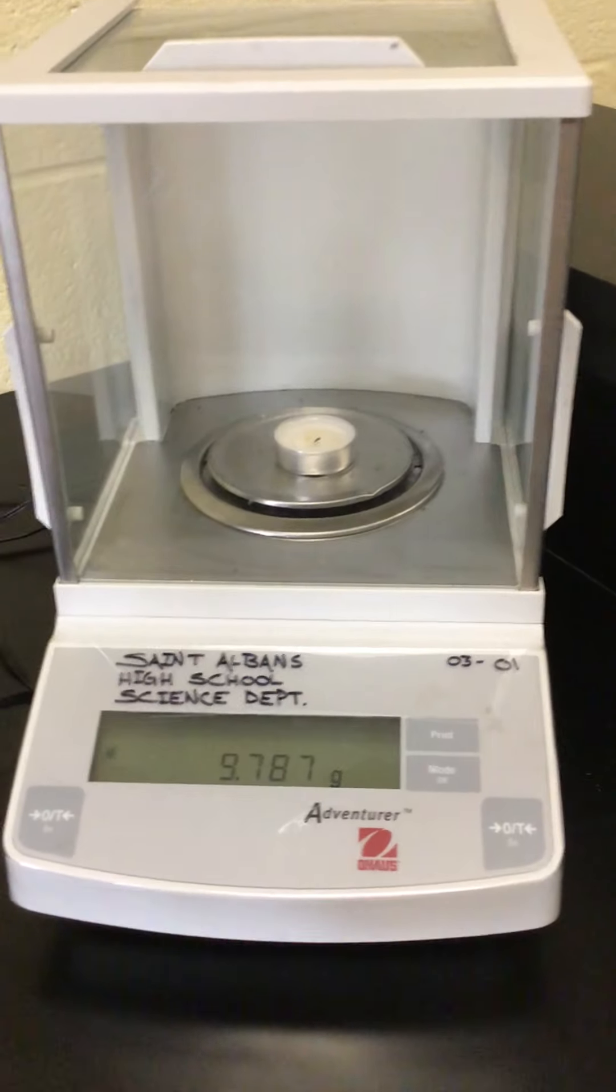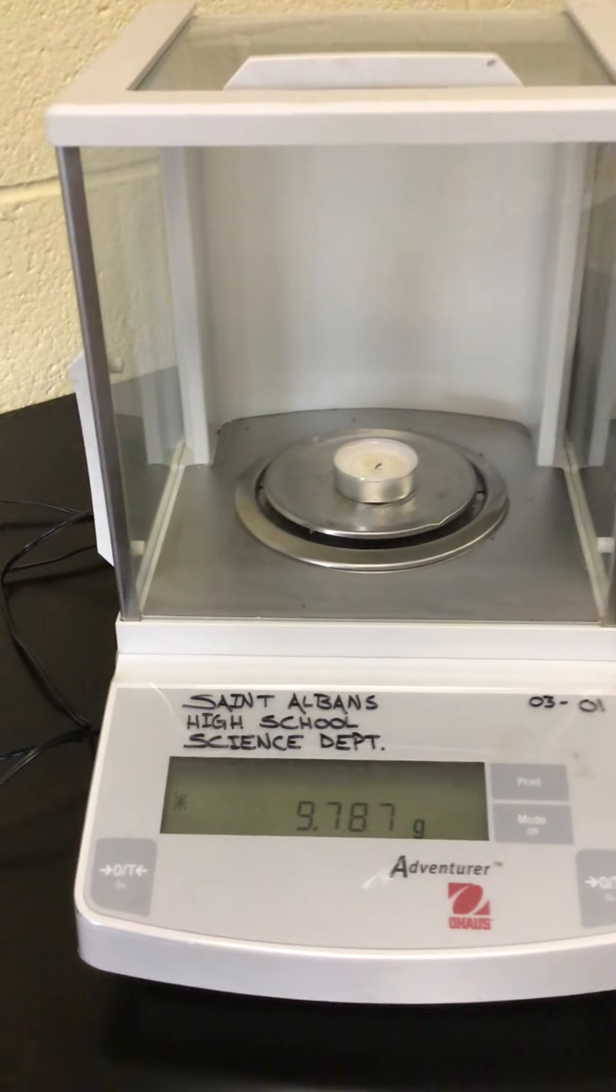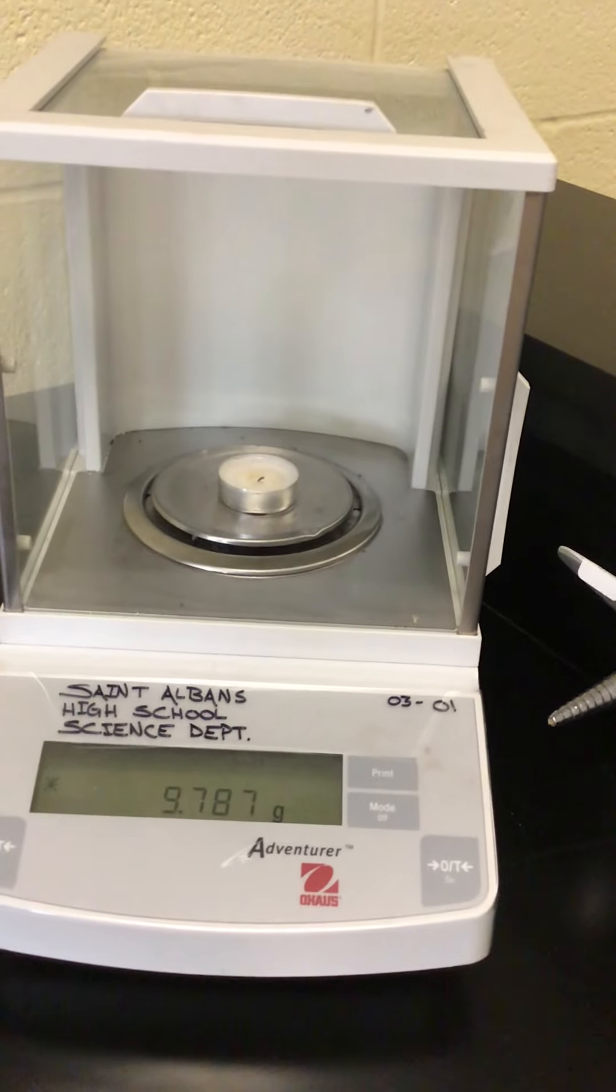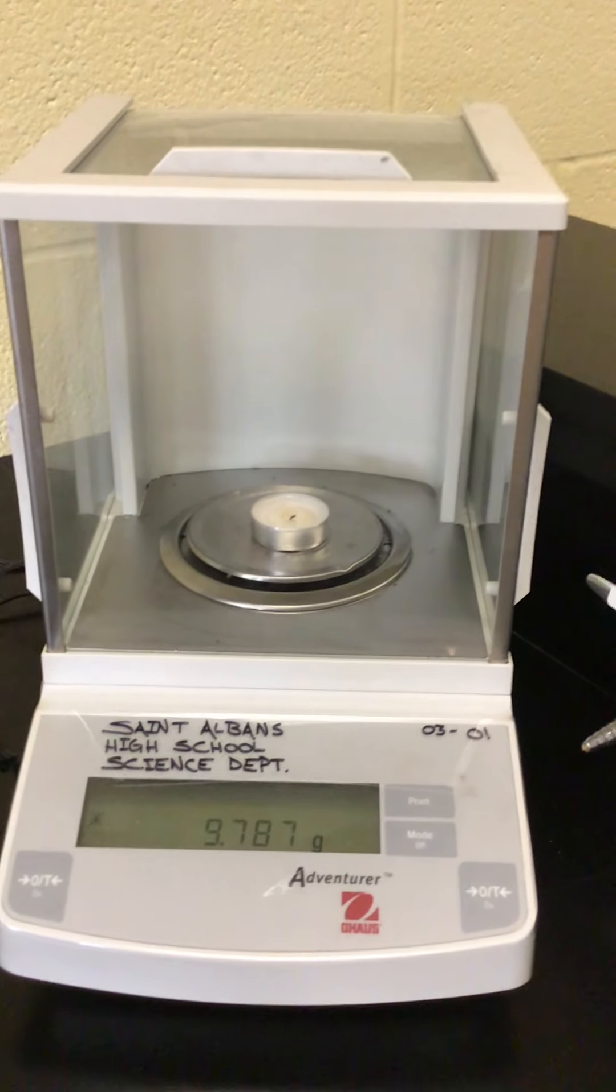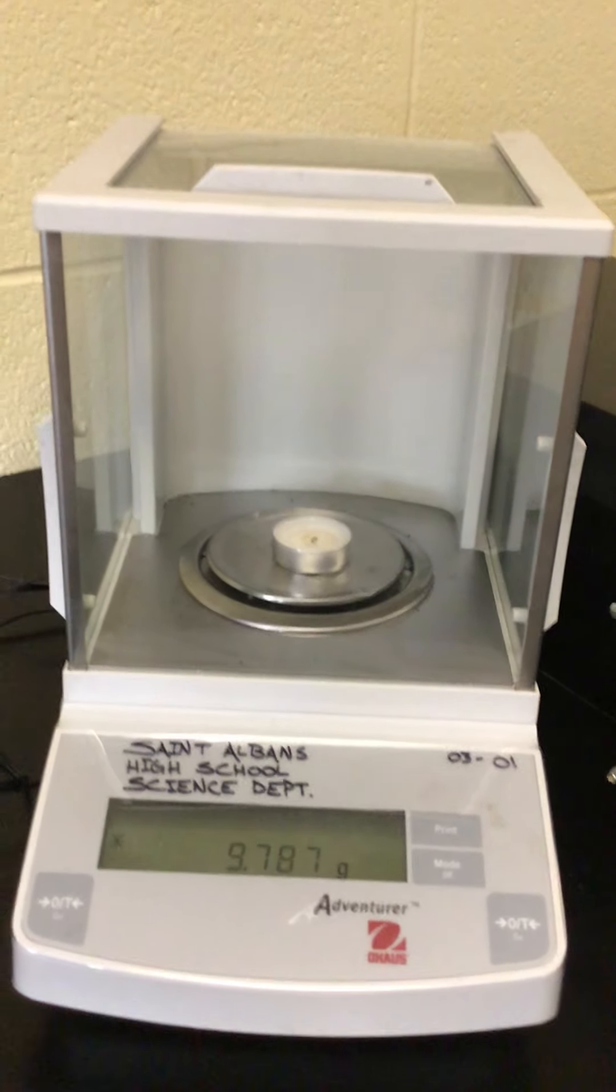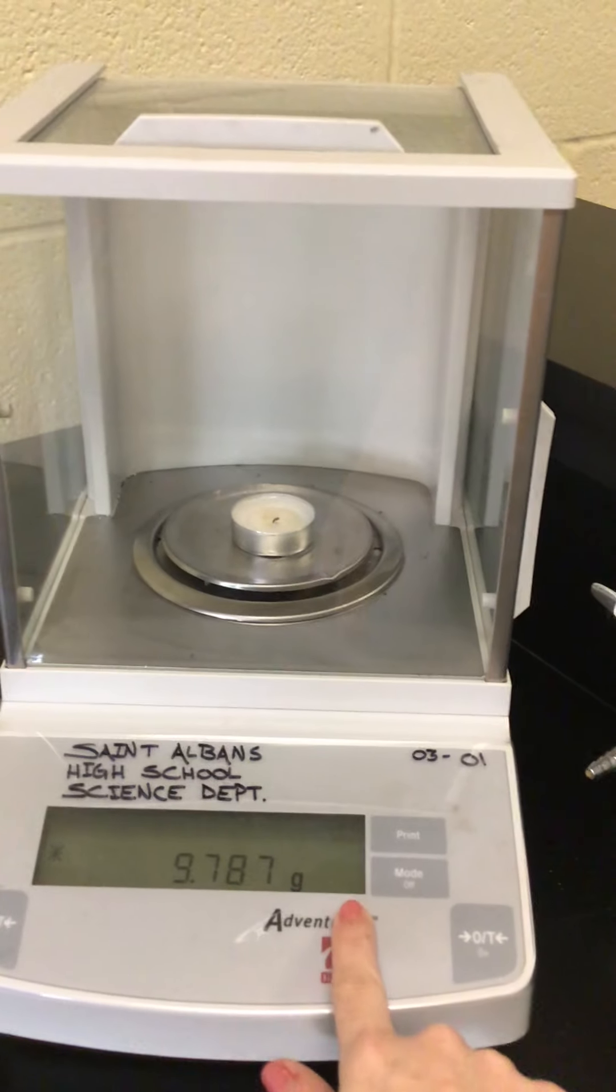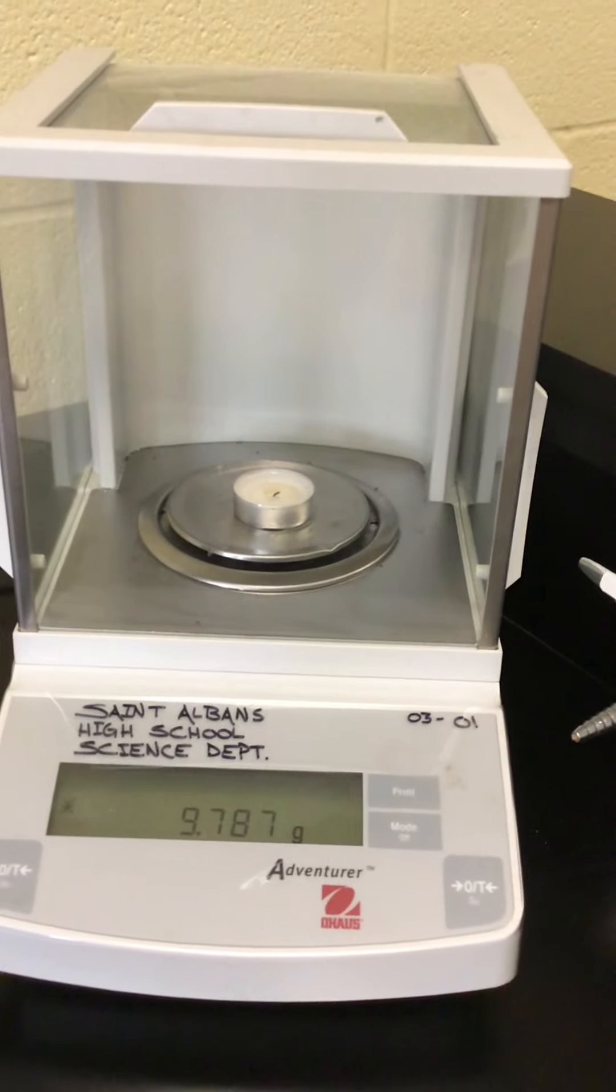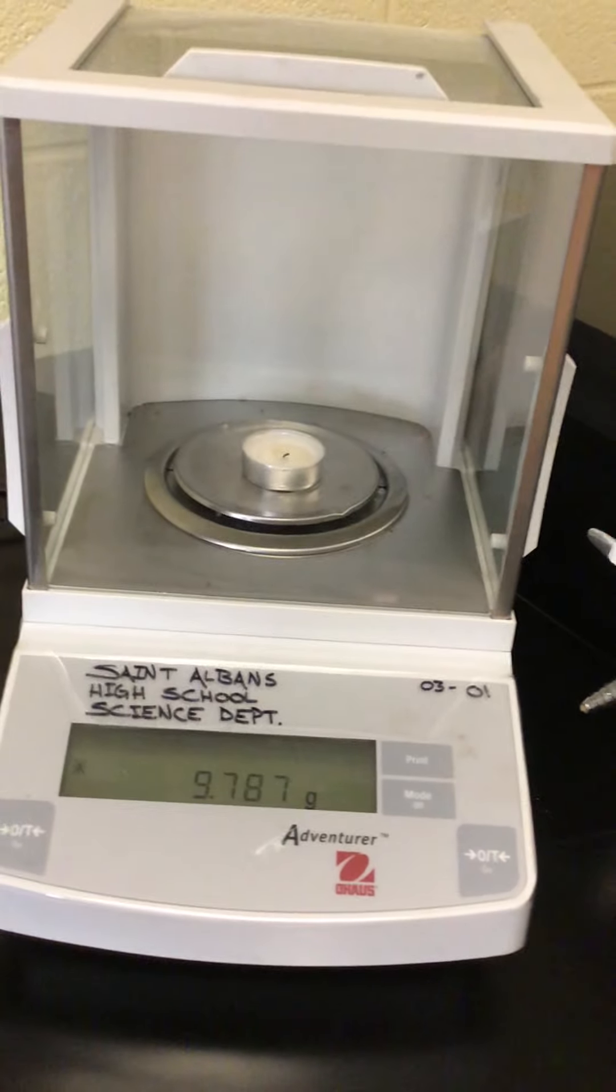Now this last digit right here is what we would call an uncertain digit for sure because it could be 9.7865 that's just rounding up to that last digit of a 7. So for this reason when we use a scale we always want one that goes one digit at least past the digit that we want.